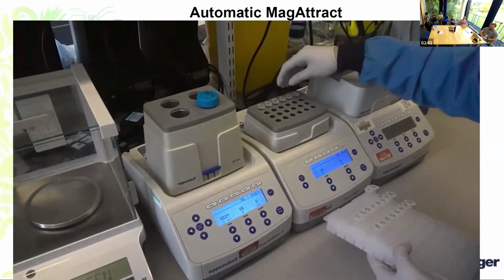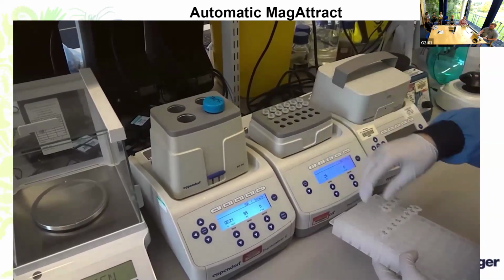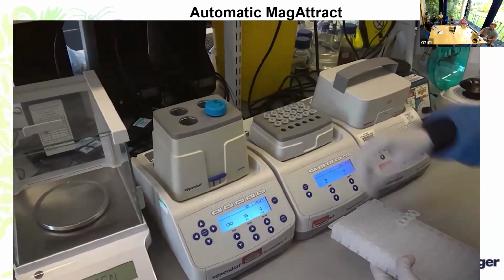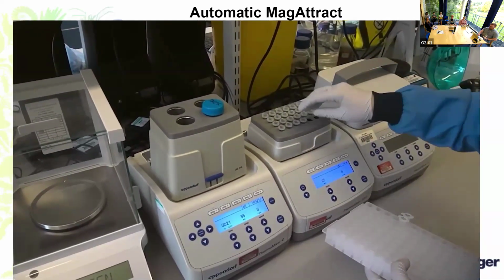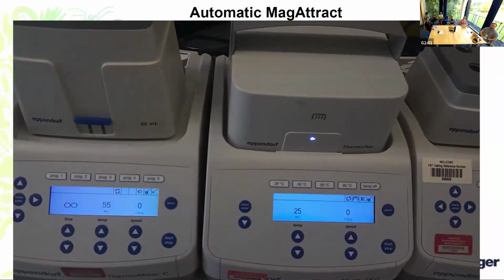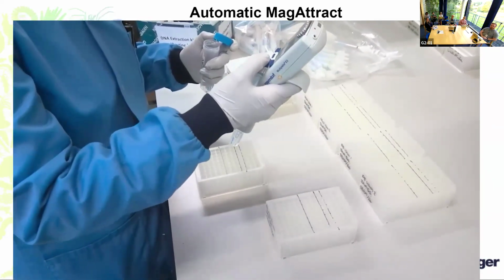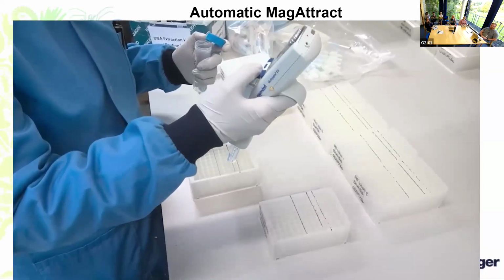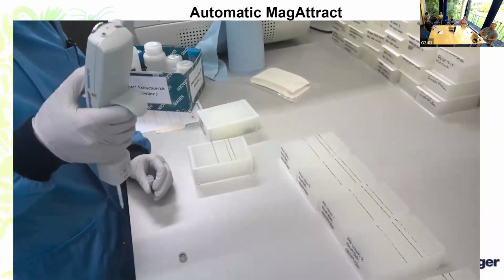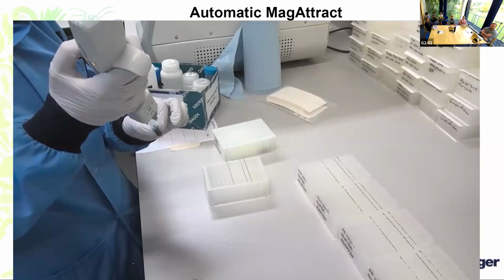In this video, we're showing you our automatic MagAttract protocol, which is done on the Kingfisher. But prior to samples being loaded into the Kingfisher plates, we lyse samples in individual Eppendorf tubes. Samples are loaded into the heat block at 25 degrees for 2 hours. While samples are lysing, we can also fill in our Kingfisher plates with the different wash buffers. We have 2 washes of MW1, 2 washes of PE, and then 2 water rinse steps. We prepare those in advance.